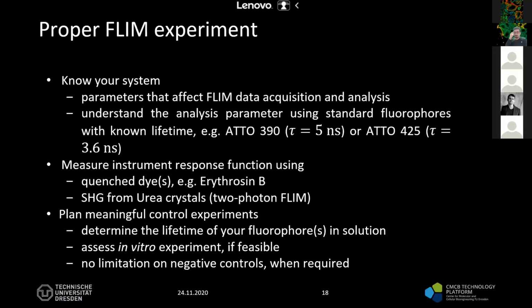Yes, it's just that when we are measuring intensities, we get some of the information. What we have is a gray value, and if we know how the number of photons or the actual optical signal is translated to the gray value in the histogram, then we can calculate it back. But with lifetime data, it's not always clear, or at least this information is not always shared with the user, unless you build your own system and know what it is, or you write your own software.